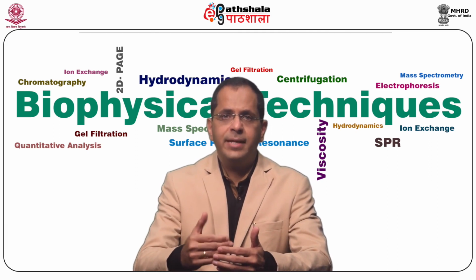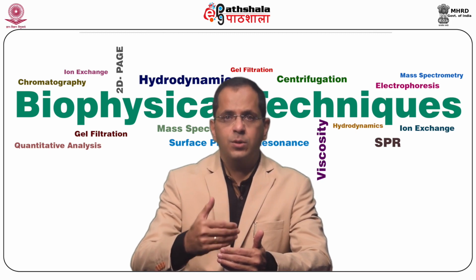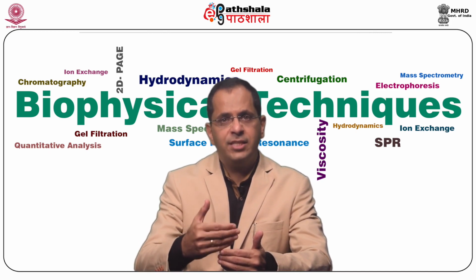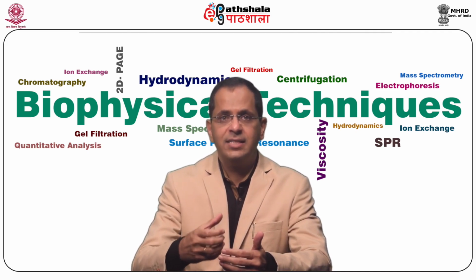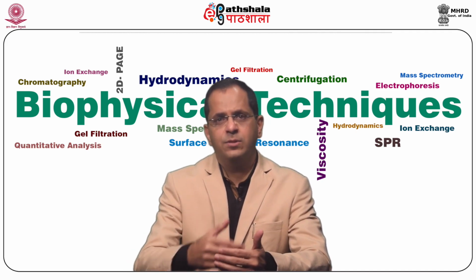Mass spectrometer based reduced detector response or signal to noise ratio is a manifested effect of competition for ionization efficiency in the ionization source, that is between the analyte of interest and other endogenous or exogenous molecules.